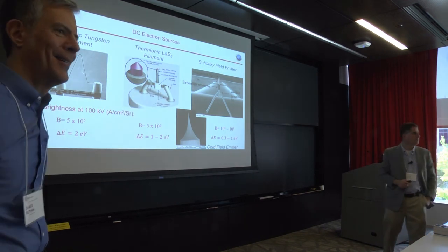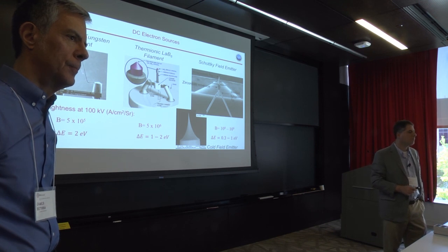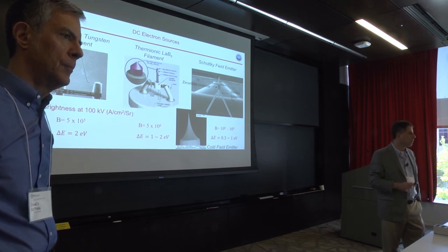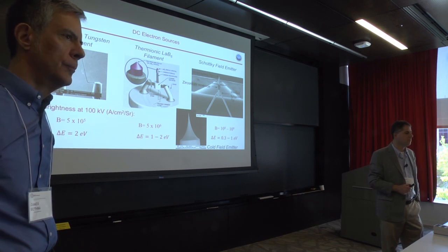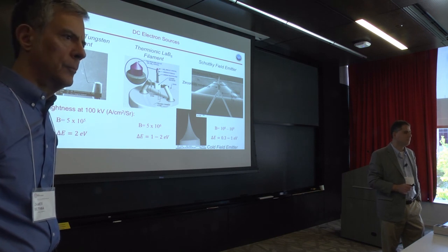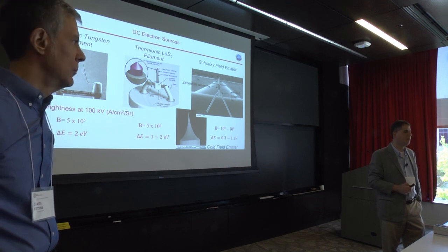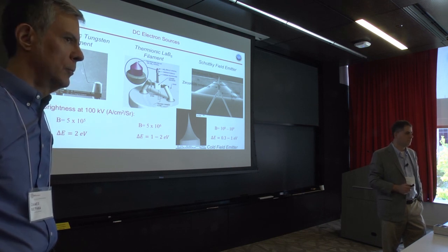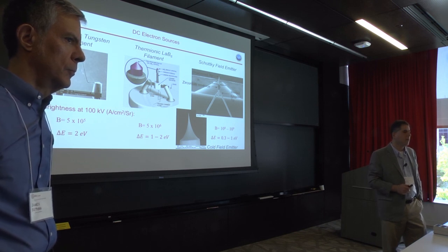One more question. There's a large part of this audience that's looking towards time-resolved microscopy. And as one pushes down to a few femtoseconds, you have a time varying initial pulse from your photocathode. I think most of your presentation, which was lovely, was about DC and very stable things. So maybe you could make some closing comments on transient microscopy.